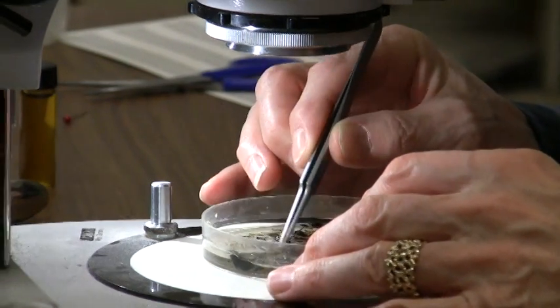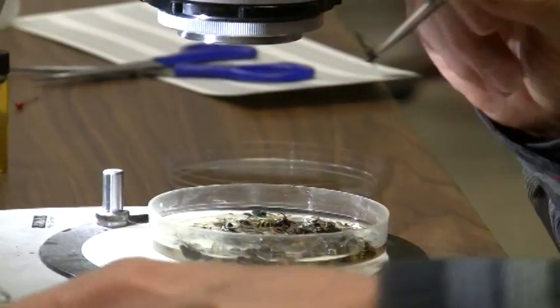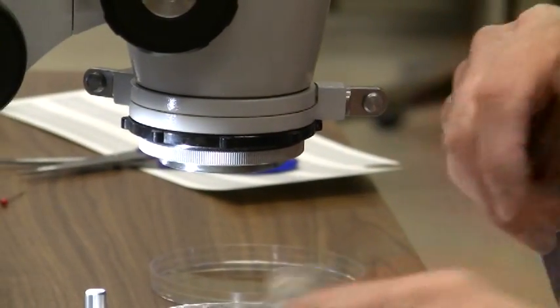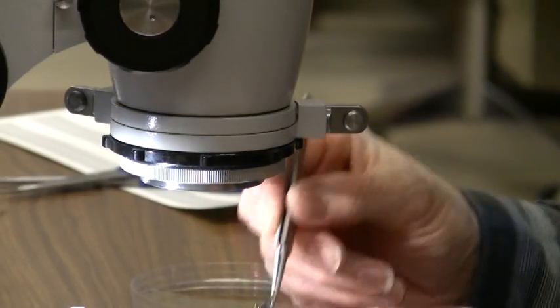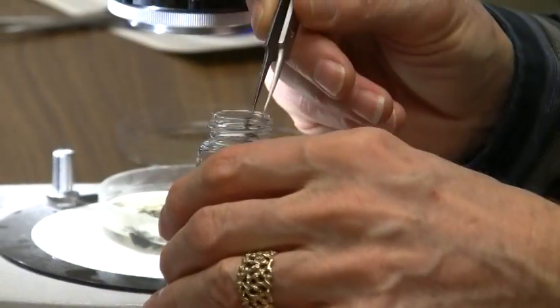So if you do find something that looks interesting, just pick the specimen out and then drop it into the vial of alcohol. The label is already in there, so you're going to know where that's come from. There's another nice waspy-like critter here — you can simply drop that into the vial as well.